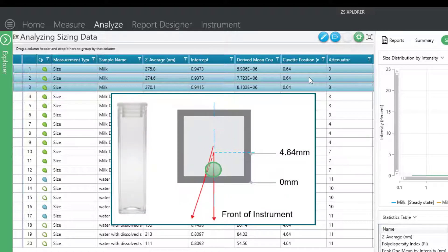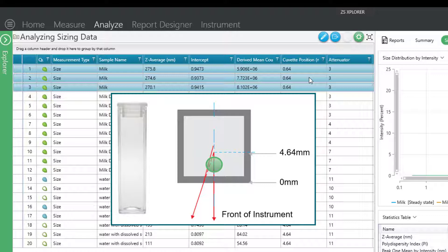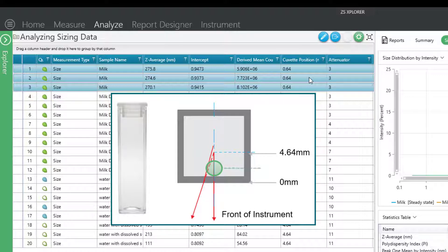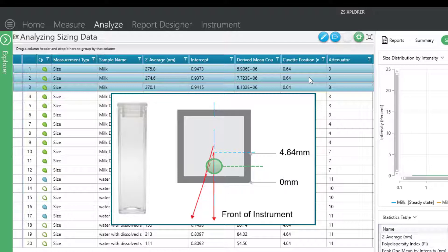Another indication is that the cuvette position is very close to zero. With non-invasive backscattering, we can change the focal position within your cuvette to avoid events such as multiple scattering. If you notice in this case that the cuvette position is very close to zero or close to the edge of the cuvette, you know that the instrument is trying to optimize and eliminate multiple scattering by pushing the position that it's measuring towards the edge of the cell.